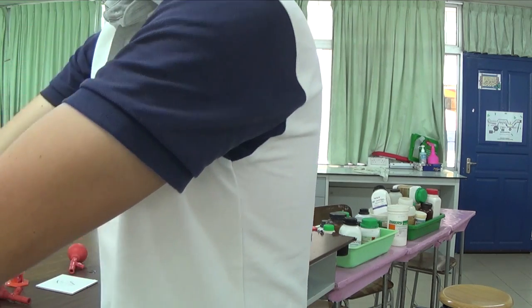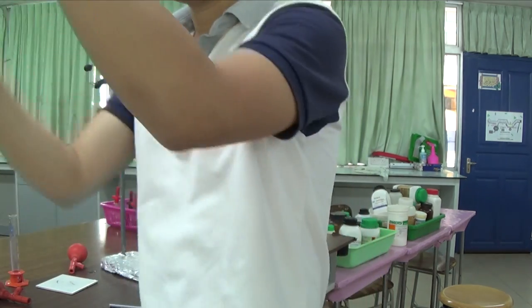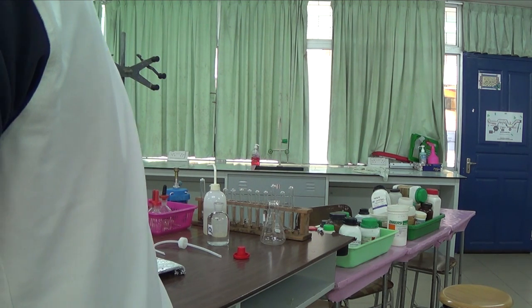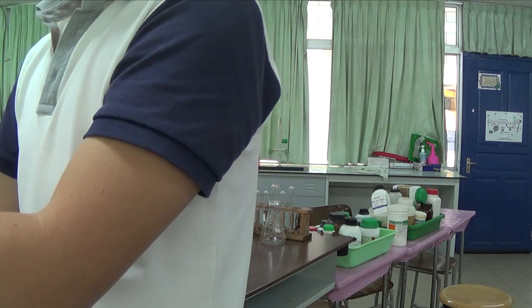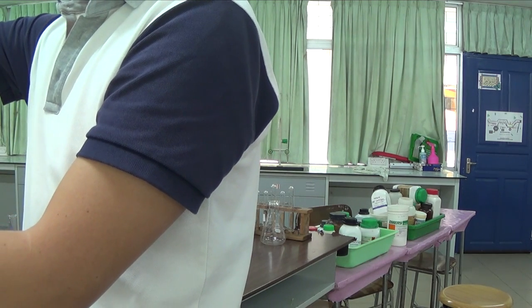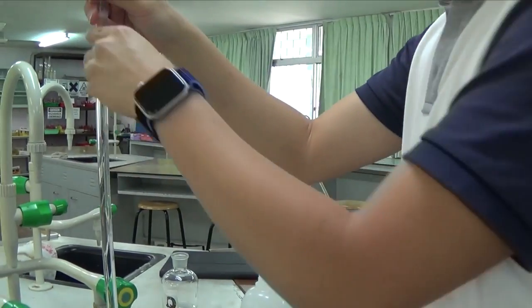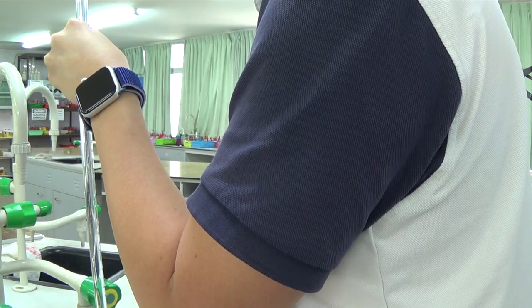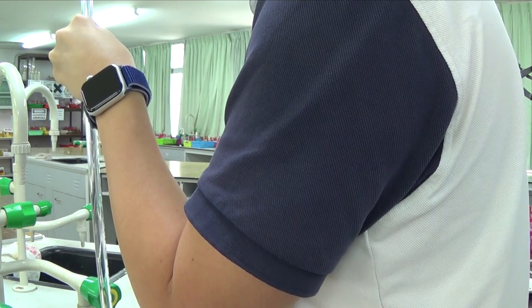And when filling out to the very top, that means the 0.00, which is there, but I've overshot a little bit, so it's okay. I'll just run whatever I overshot into the sink. So I have overshot again. Well, I mean, I've passed the 0.00 mark again. So these things take some practice, right? So I'm holding out my hand instead of doing this on the stand because I'm comfortable enough with my burette. And I've reached 0.00.